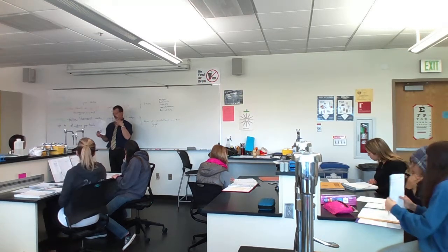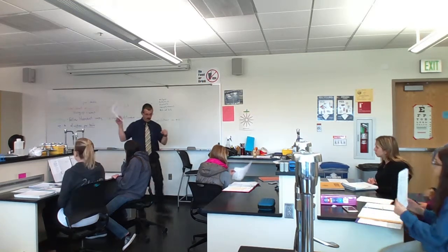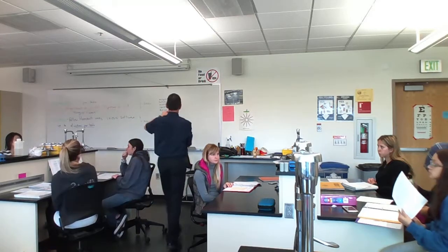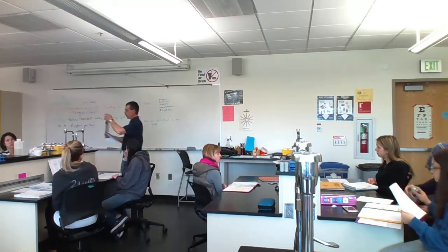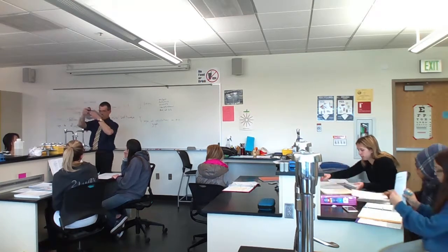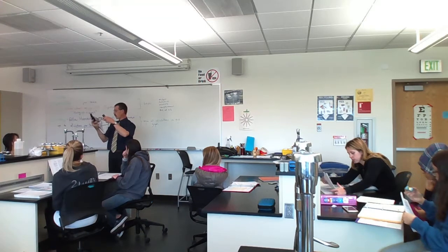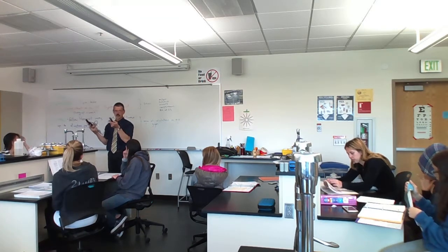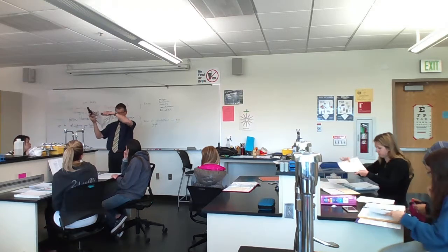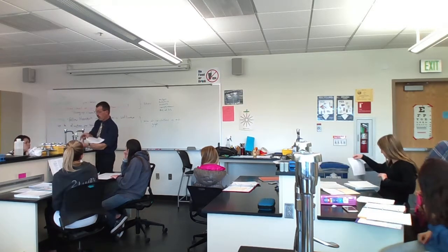So unlike plug and play, it doesn't plug and play. So before you turn on the computer, you have to hook it all up first. So I'm going to reach over you. If you remember last term vaguely, there's all these cables. So you're first going to have this cable hooked to the computer, this thing hooked to this thing, and then turn the computer on. Otherwise, it won't know what you did. You'll spend 2 hours looking for the software. Once they're all hooked together in this weird daisy chain, turn on the computer, and then the program should be able to find that information.